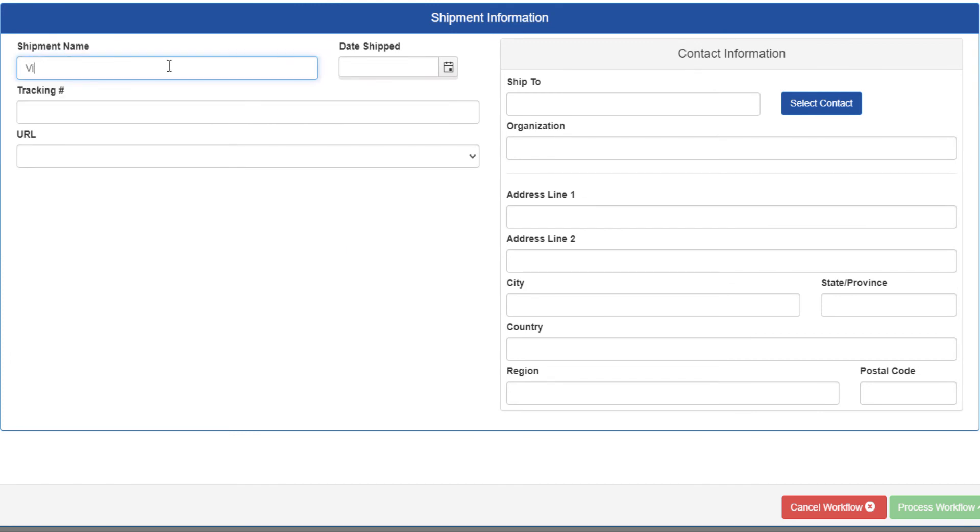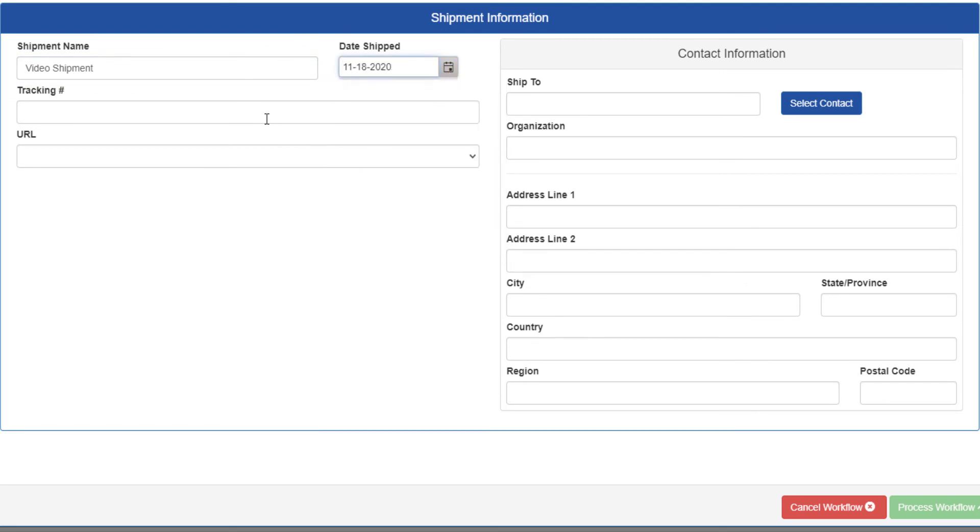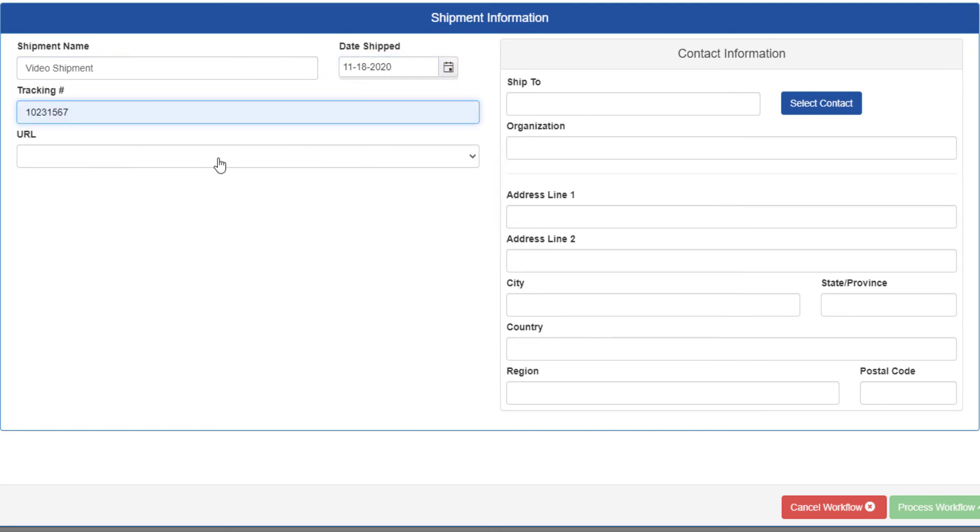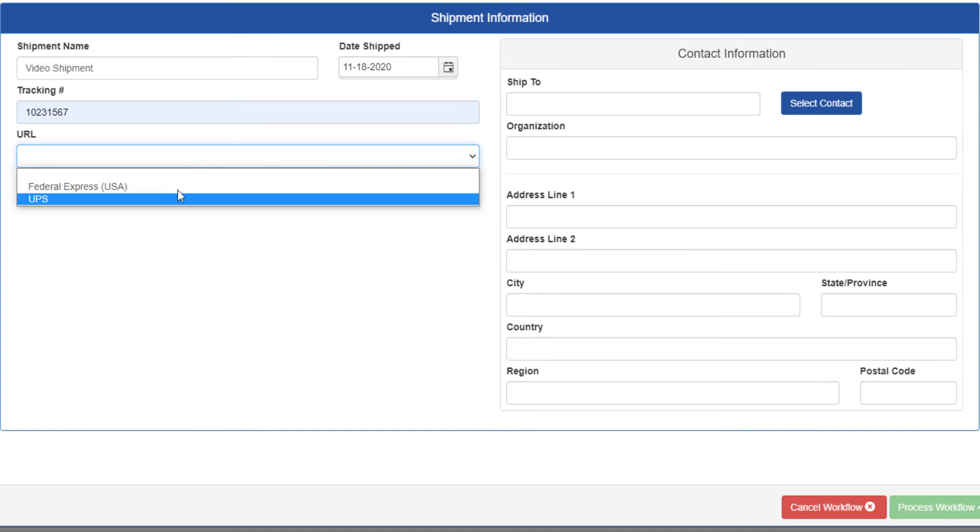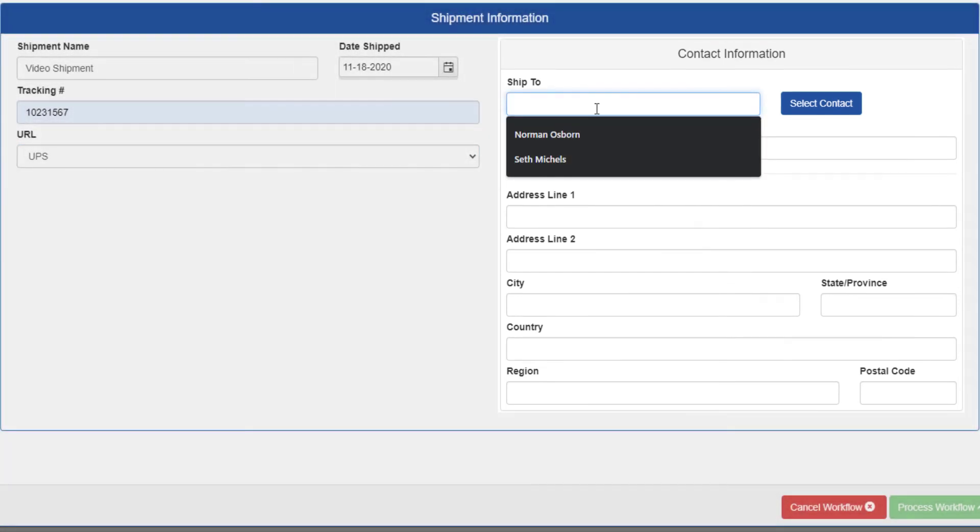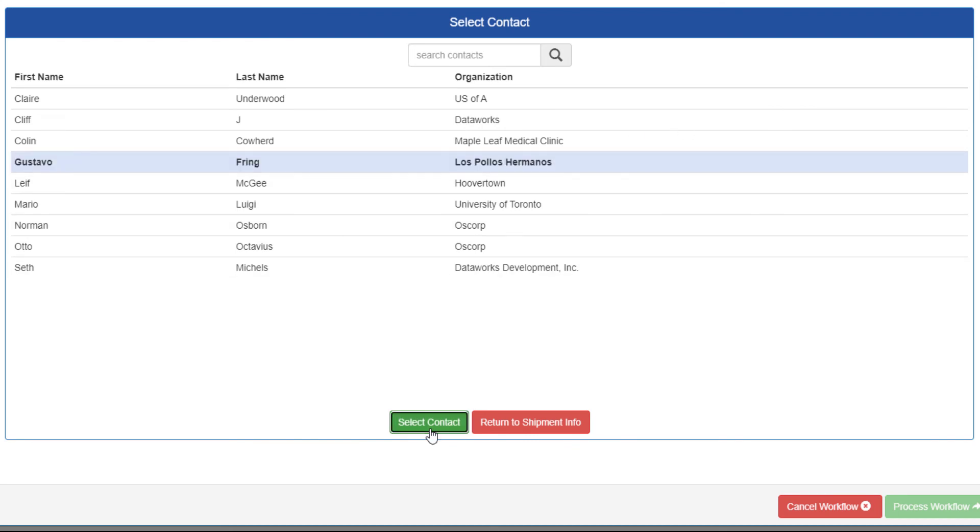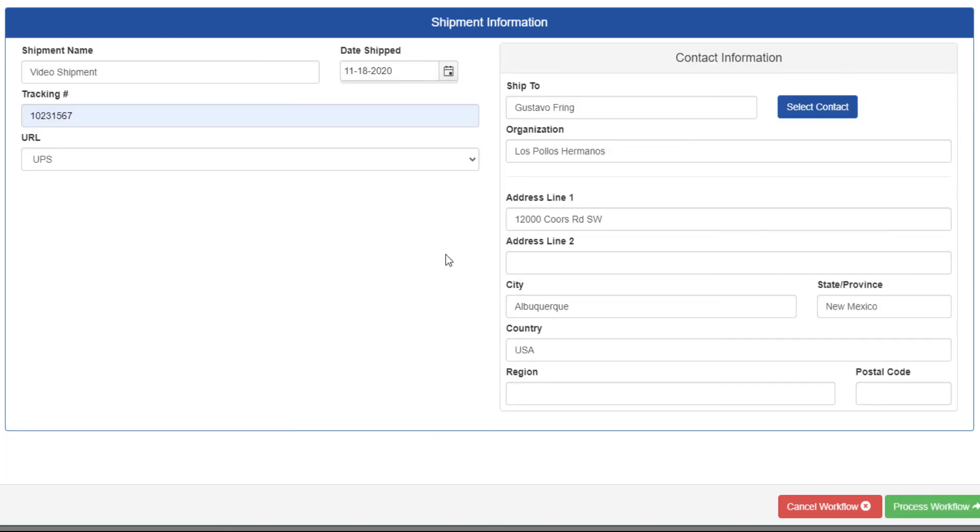Enter a name for the shipment, a date, and tracking number if you have it. The last step to this page is entering the contact info. You can fill it out manually, or click select contact and choose an existing shipping contact from people added to your database. You are allowed to edit any of the contact info after selection if you need to.